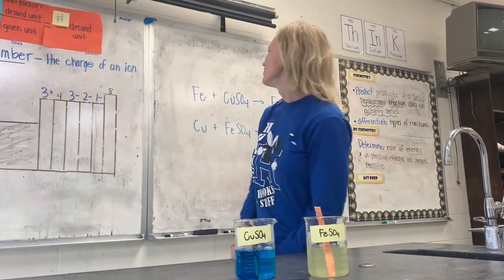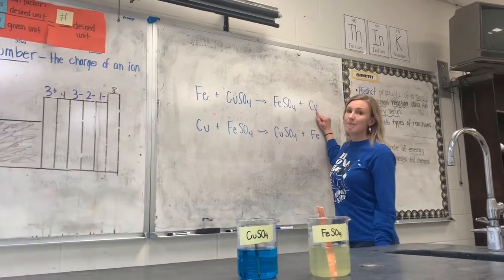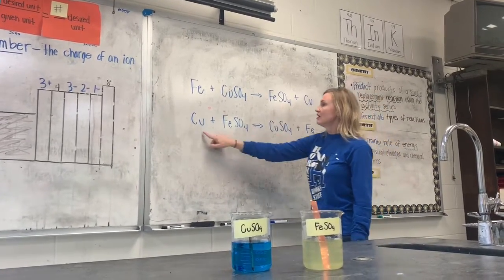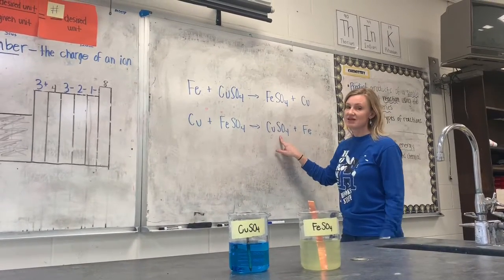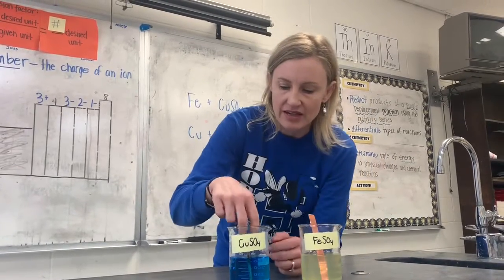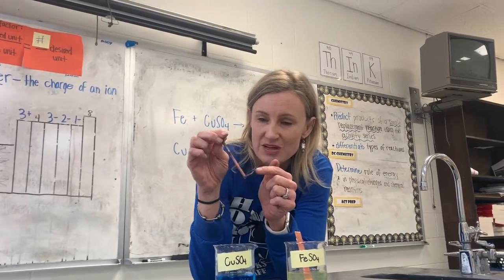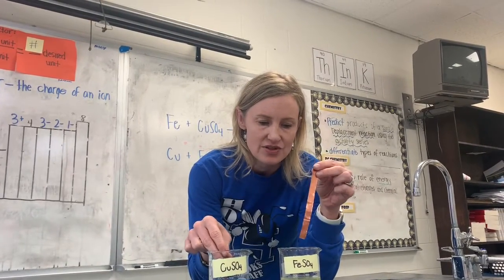Okay, let's talk about this. For this reaction, we should see metallic copper being produced and more of the pale yellow color. In this reaction, you should see metallic iron being produced, and then maybe that solution turning blue. So what we're seeing here, looking back again, is metallic copper being formed on this iron in this solution, but nothing on this solution.